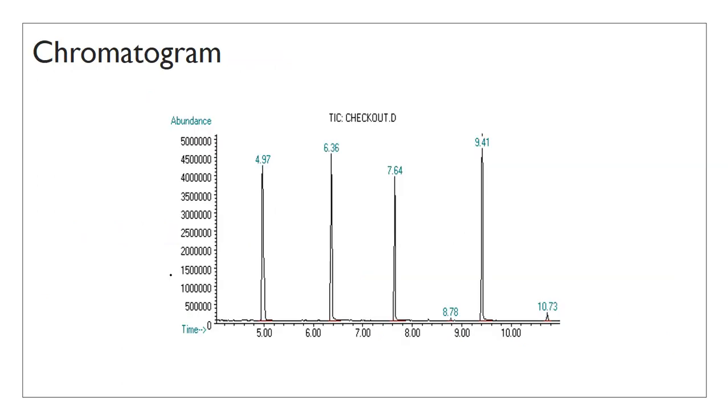Okay, so this is what the result looks like. You need to be able to read it and understand what's going on and then use it. This is called a chromatogram. Very similar to NMR, there are a few features that you need to pay attention to. The first one, again, would be the number of peaks, and in this case, it is a representation of the number of molecules in a mixture. So if there are 1, 2, 3, 4, 5, 6 peaks, there are 6 different molecules present in that mixture.